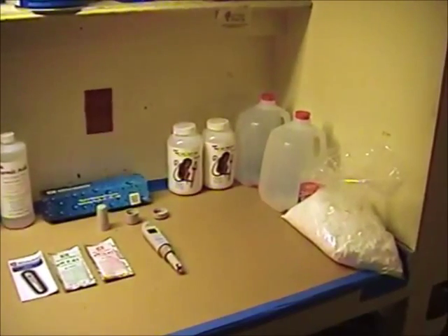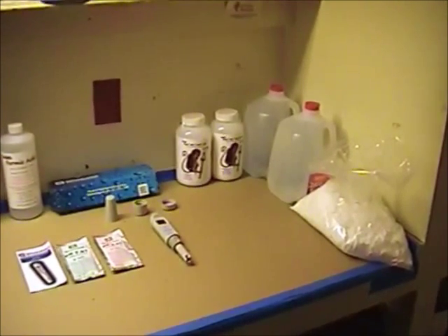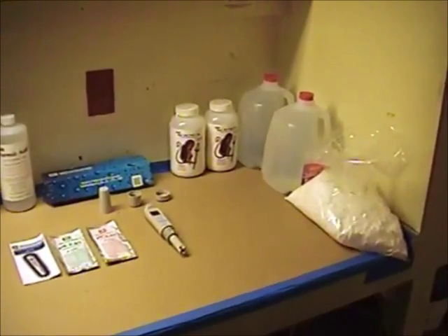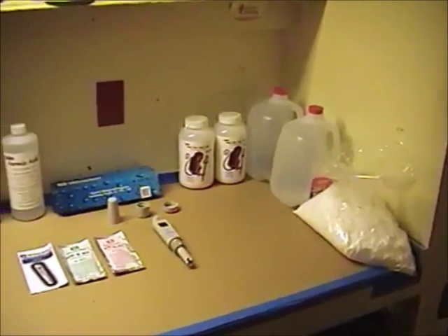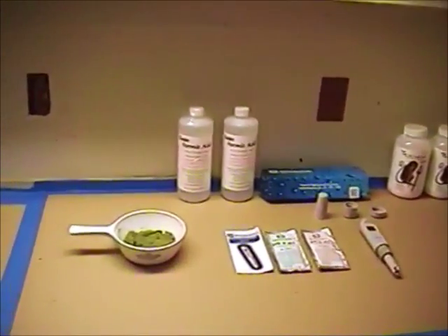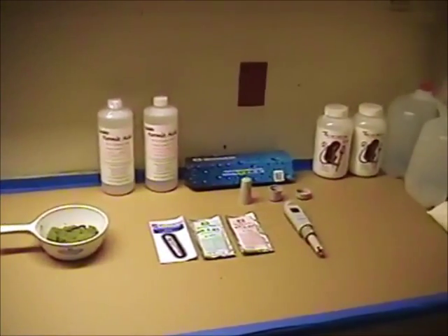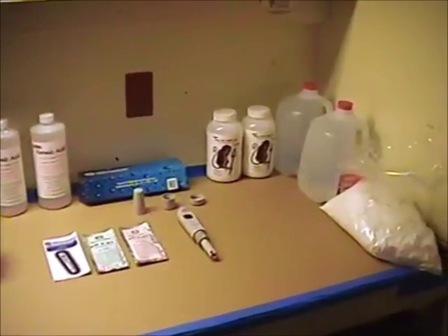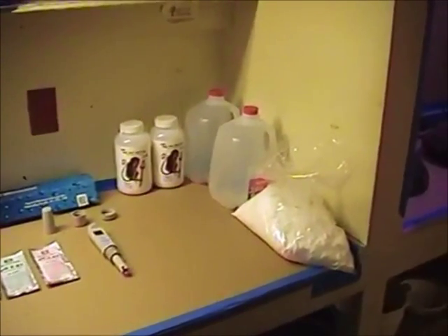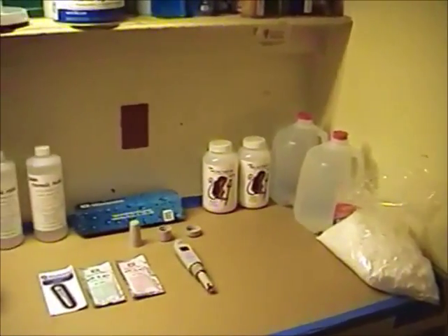Good afternoon gentlemen and welcome back. I decided I'm going to shoot a short video series on a sodium formate reduction of silver from a nitrate solution. What I have in front of us here are a few items that we're going to be using in our experiment. Now this will be a first for me also.